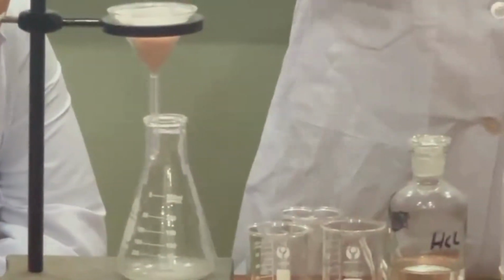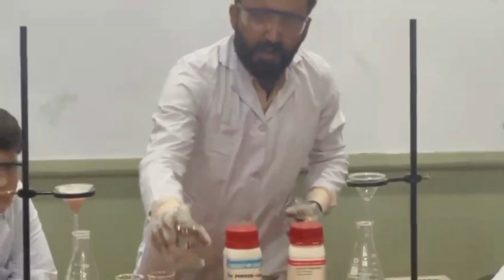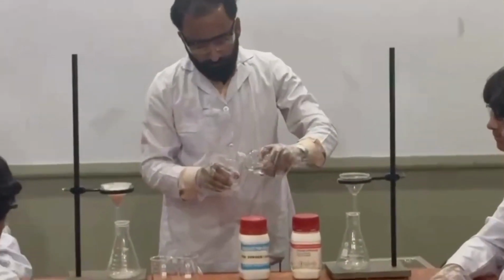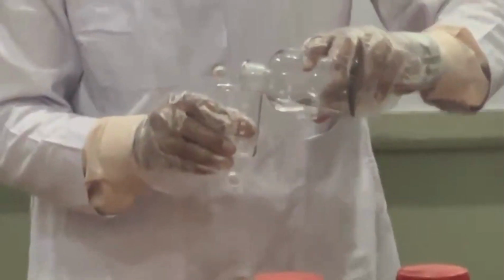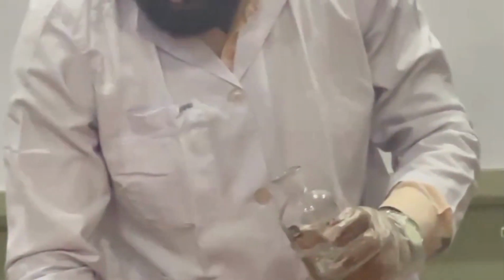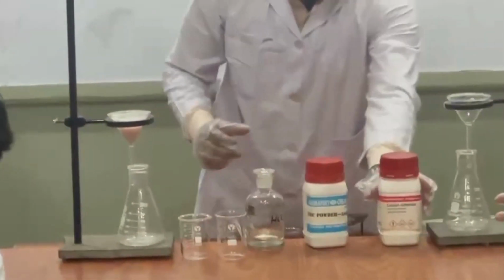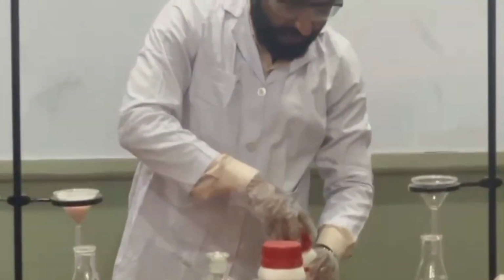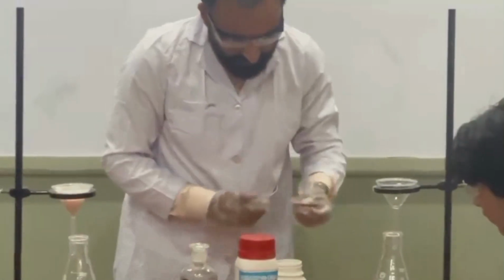Okay, now go for the other reaction. Dear student, I would add some of the HCl in the beaker again. Now we will use metal carbonate, the second way of making salt. This is calcium carbonate, and we will add some of the calcium carbonate. Let's start observing this reaction.